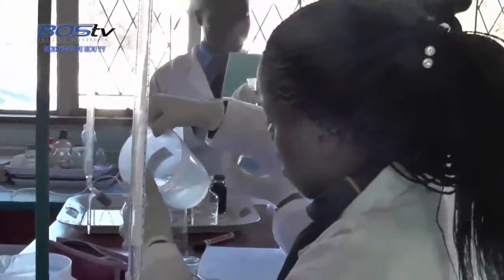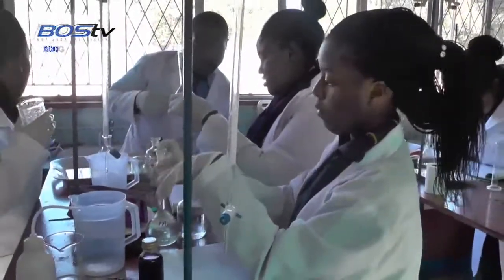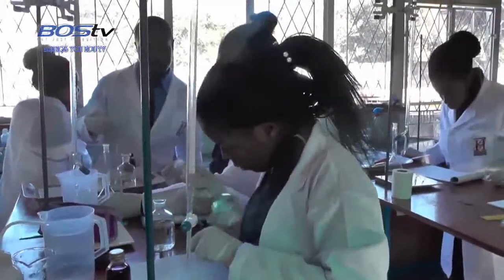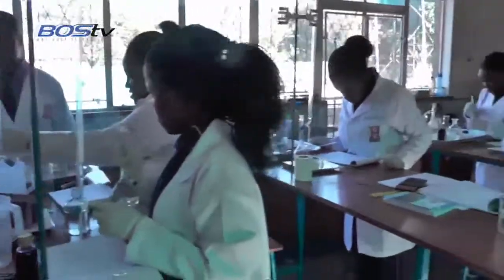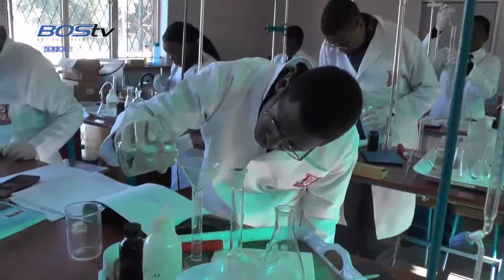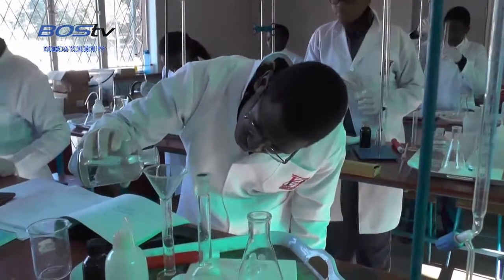Dissolving. After dissolving, make up the volume to 250 in the volumetric flask.